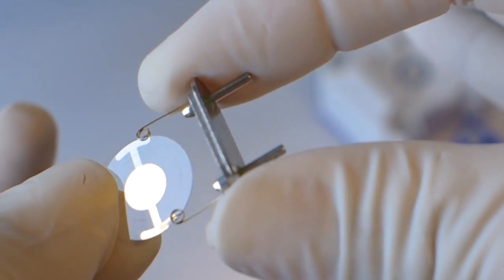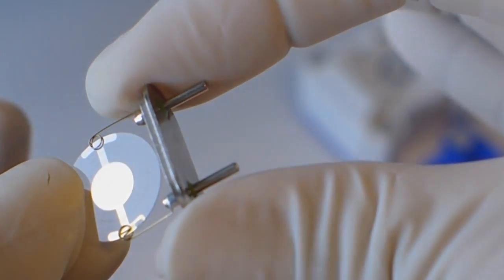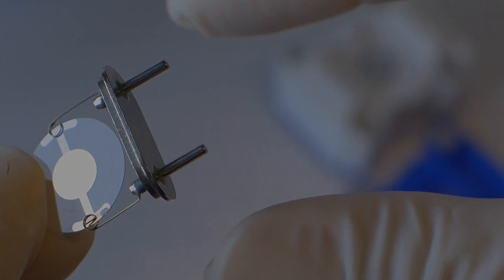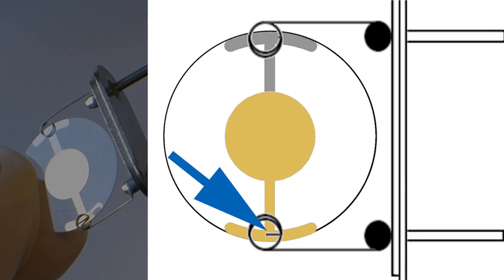Place the quartz in the holder. Be sure to mount the quartz as shown, ensuring that the electrical connections are properly seated.